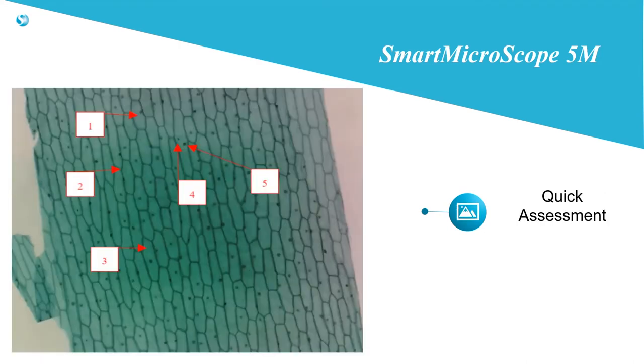The online web app includes advanced features, including a quick assessment mode. Simply click and drag within the image to point out interesting features. The software will put a number next to that arrow for students to identify the part. This is a very quick way to determine what the students have learned. The image with drawings can be saved for use on formal assessments.